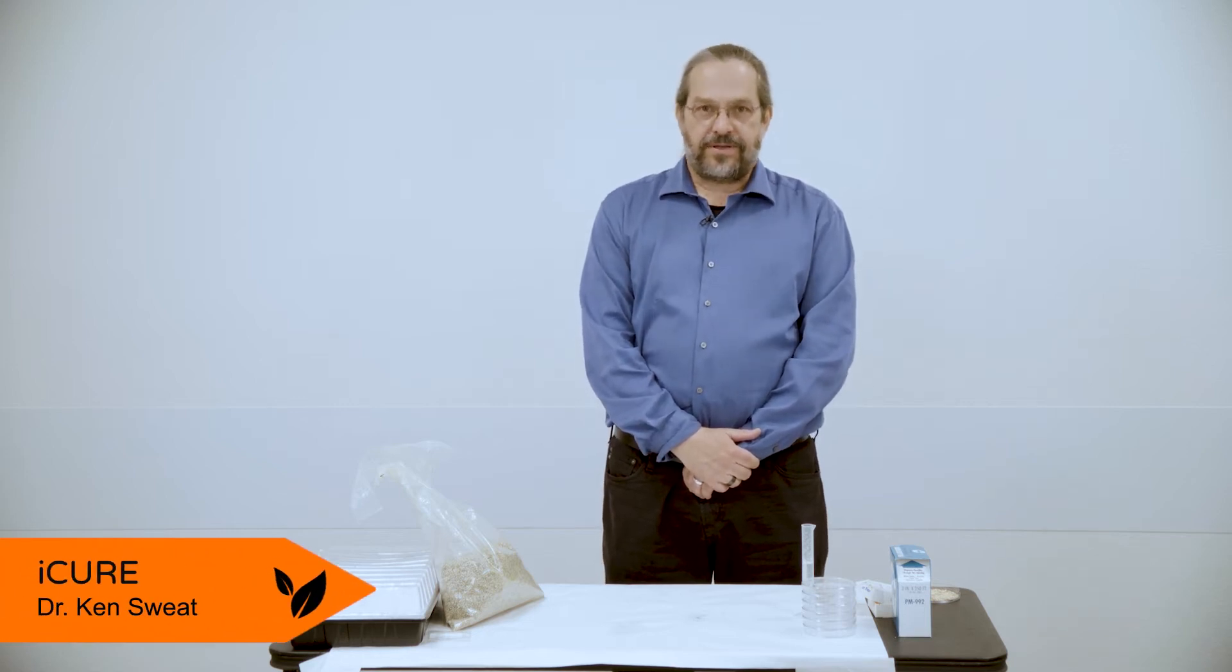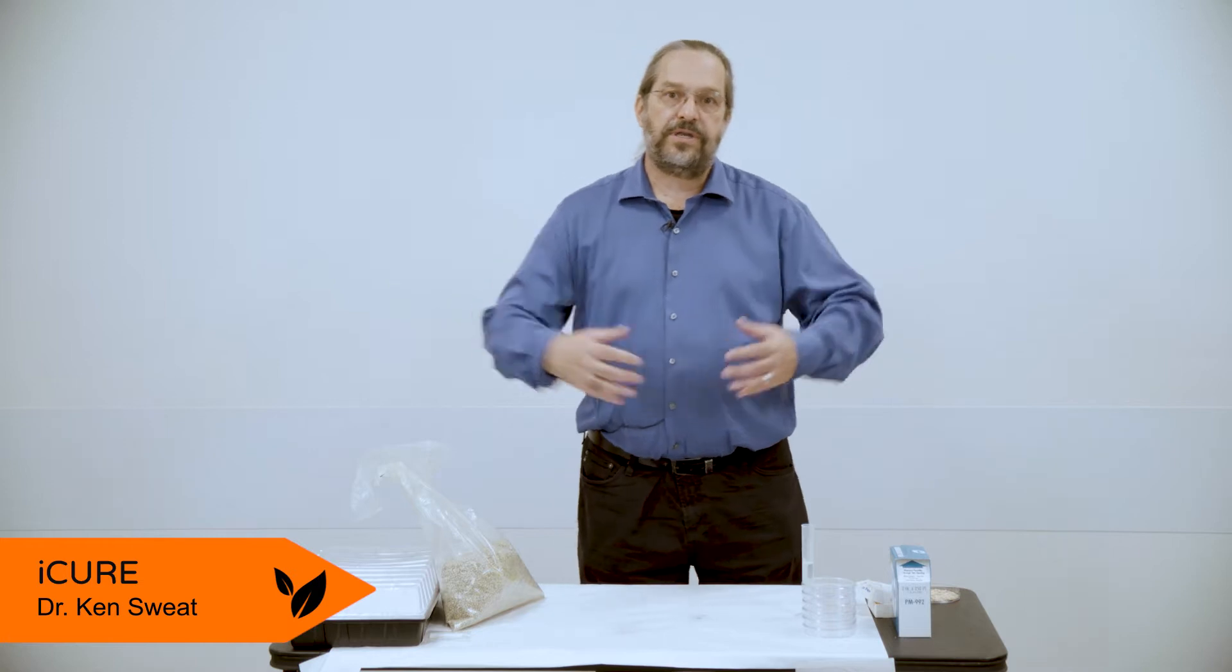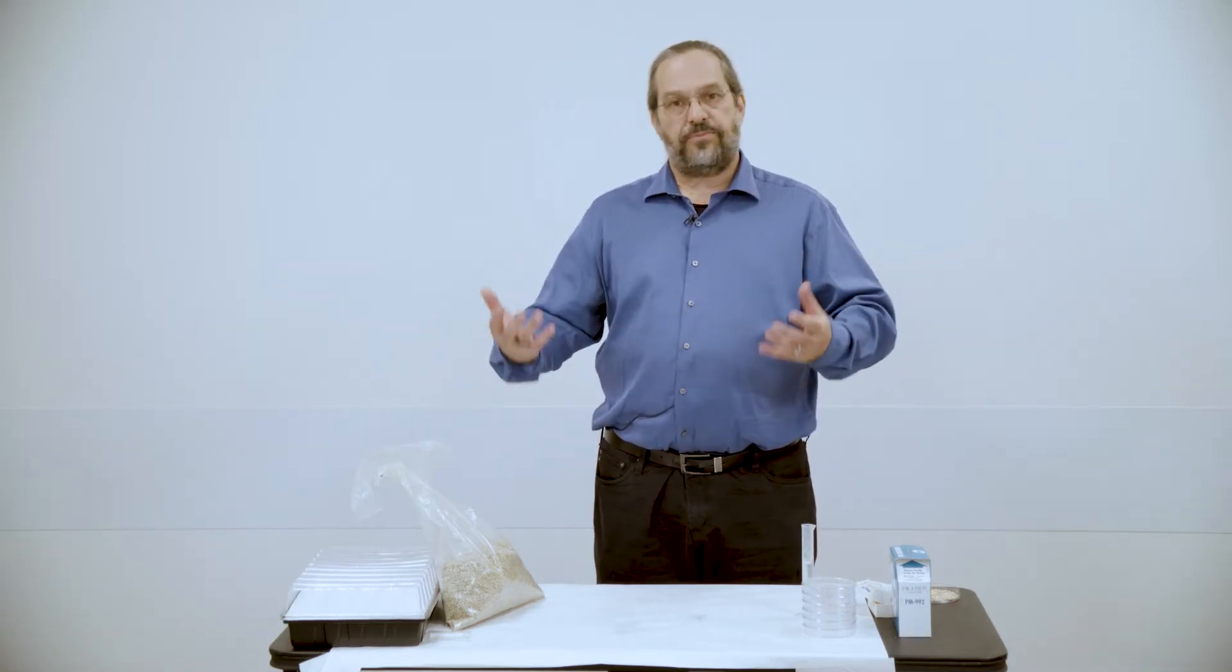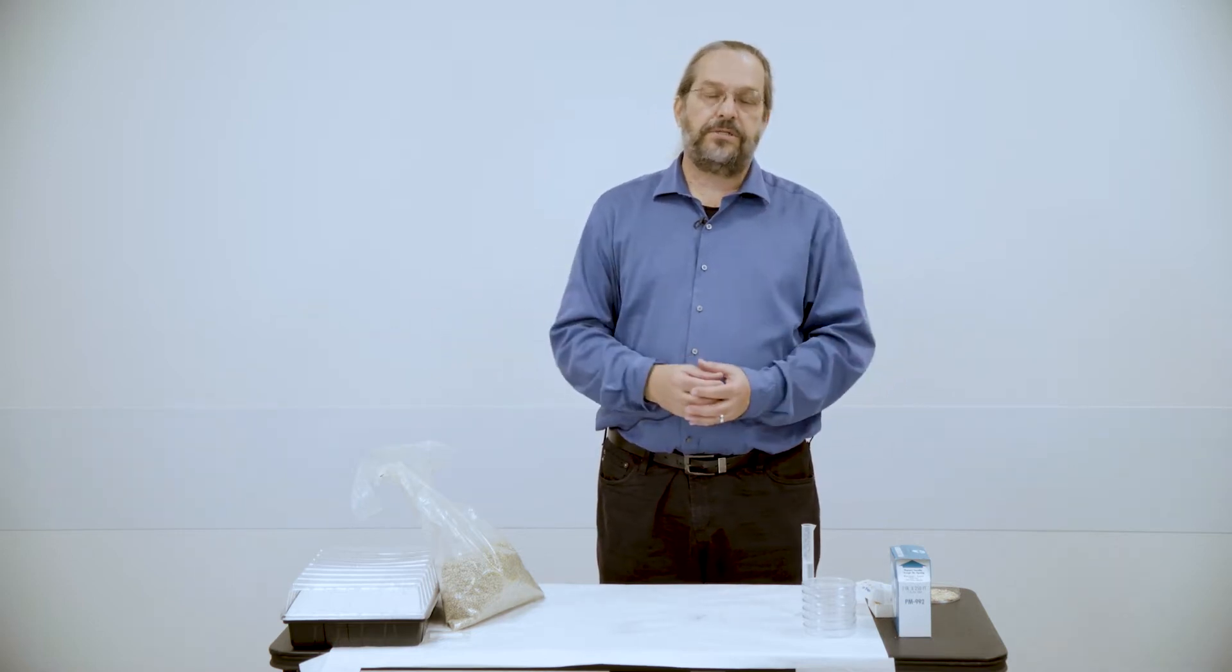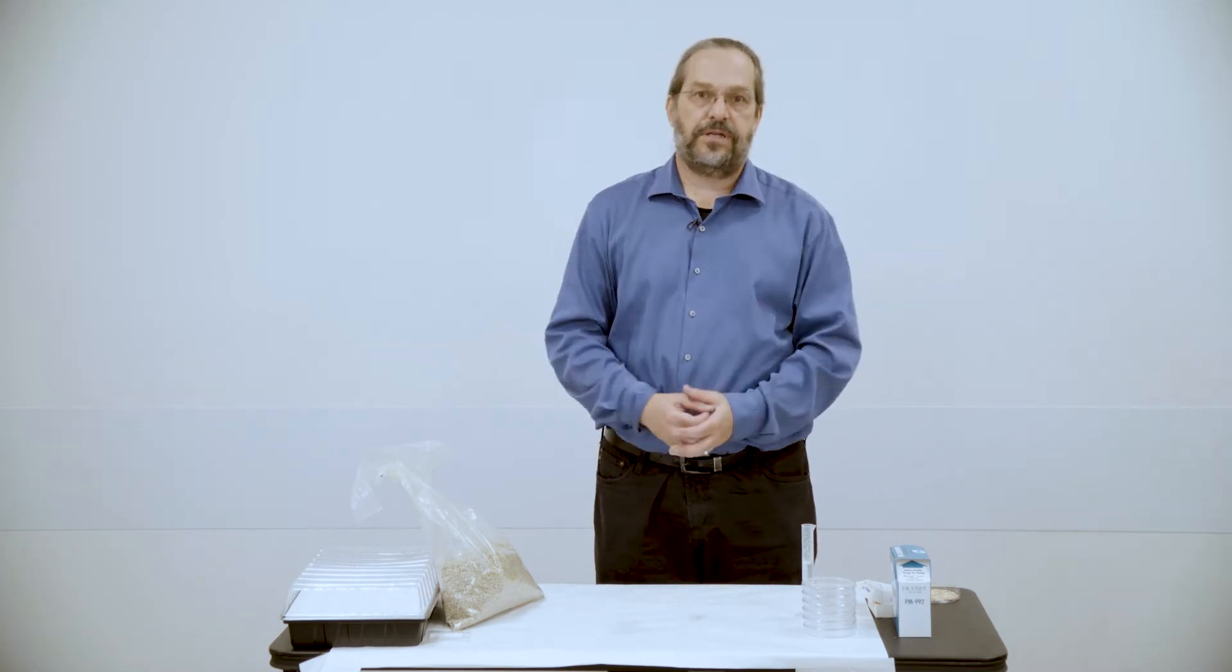All right, hello and welcome. What I want to talk to you about today is how you would put together a course-based undergraduate research experience looking at using plants to clean up metals from mine soils. This was the phytoremediation undergraduate research experience that I developed here at ASU West, and I think it's a really fun way to introduce students to science as well as try to get them interested in ways to clean up the environment.